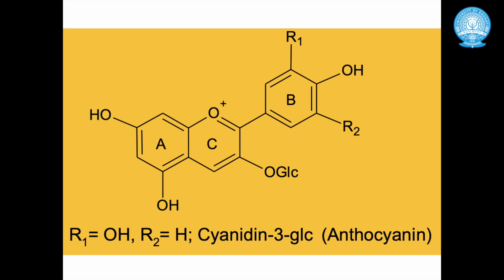Now this is all about decoding the molecular signature of an anthocyanin molecule, but anthocyanins are quite well studied. So we have a lot of literature information, and we can always go back to the literature and hunt for similar or relevant information to identify the compound at hand.